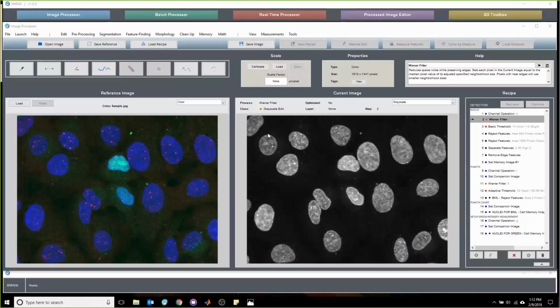And just to add a couple more points to the auto threshold question, like Paul mentioned, oftentimes what he was speaking to was how we can use our contrast tool to auto set the contrast, which can then assist in running a basic threshold with auto mode. Usually if you put some kind of normalization step ahead of auto threshold, then auto threshold works even better, and that's exactly what auto contrast low, high or both is as a normalization step.